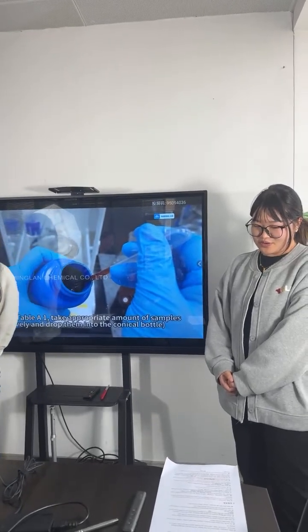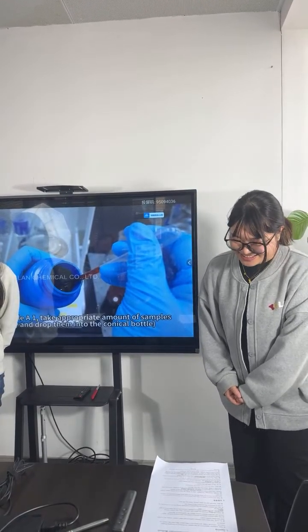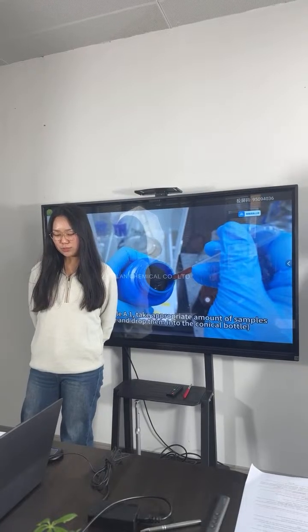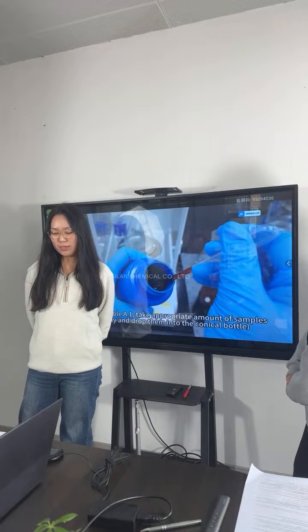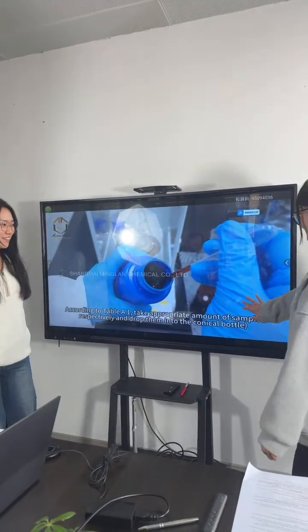How much potassium hydrogen phthalate should be added? We should weigh 0.1 to 0.2 gram of potassium hydrogen phthalate, accurate to 0.0002 gram. And in the video, we weigh 0.1406 gram. What's the next step, Winnie?